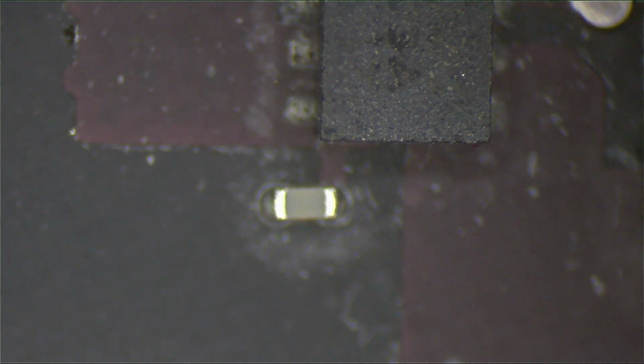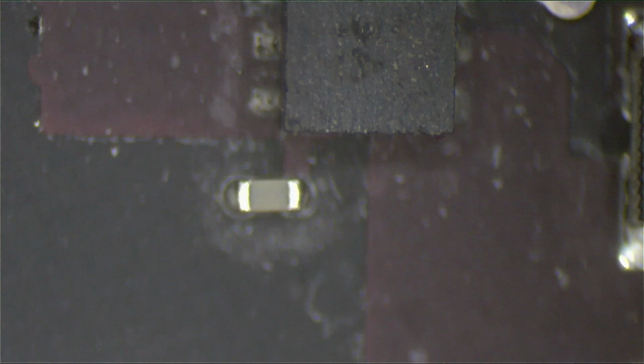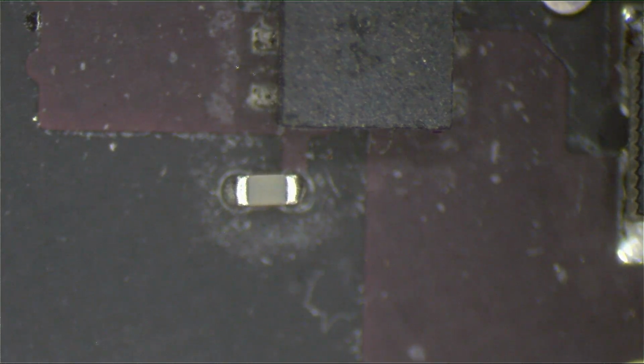Now let's go from 7x to 20x. At 20x, I get the component in focus, and when I'm moving the board on the desk, you can see it's starting to go out of focus. So the higher the level of zoom, the more sensitive it is to going out of focus.